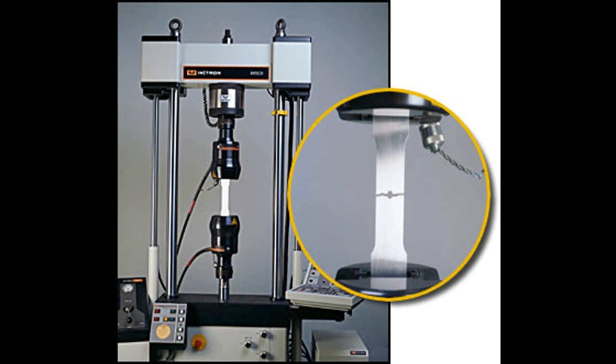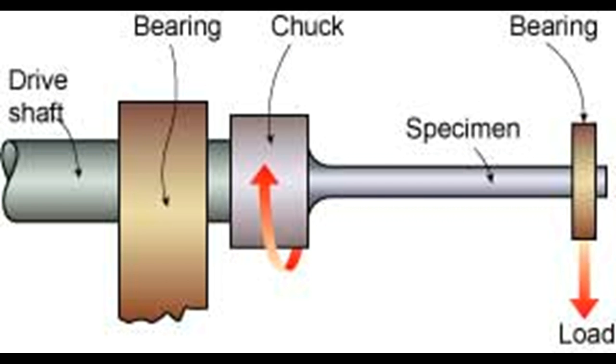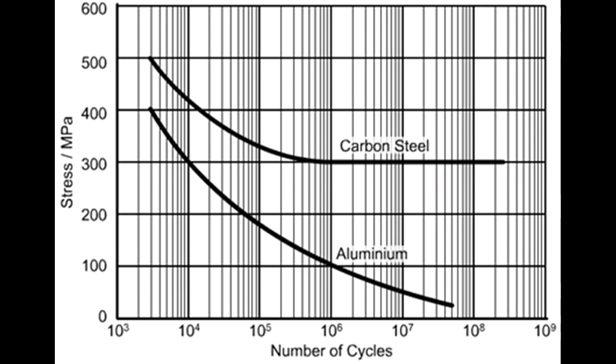Fatigue testing involves repeated loading and unloading of a specimen at stresses less than yield strength in order to determine properties such as endurance limit and fatigue life at a given stress.